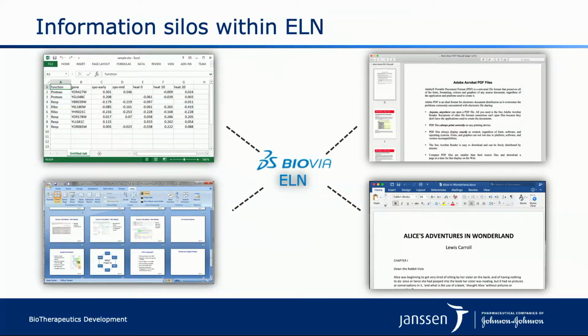They are all scattered around. They're not lost anywhere, but putting them together to generate a meaningful report does take time, especially when you go through several rounds of screening, and when you find your final clones, you want to find where the parents are and what information is associated with those parents. That becomes challenging, especially when you have multiple scientists working on the same project.